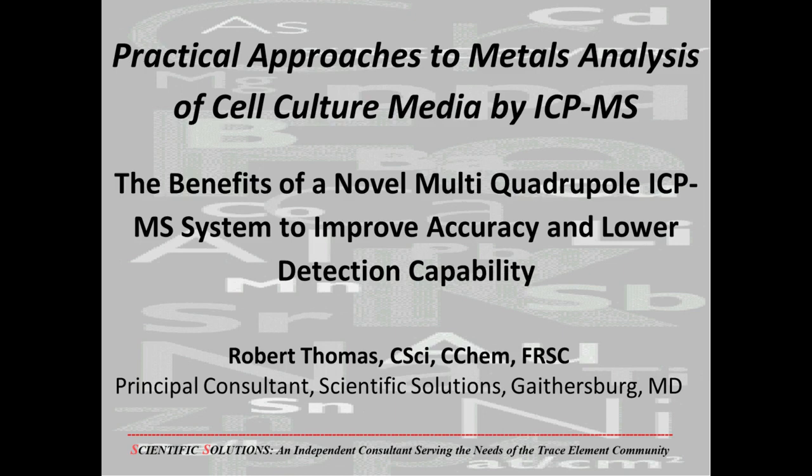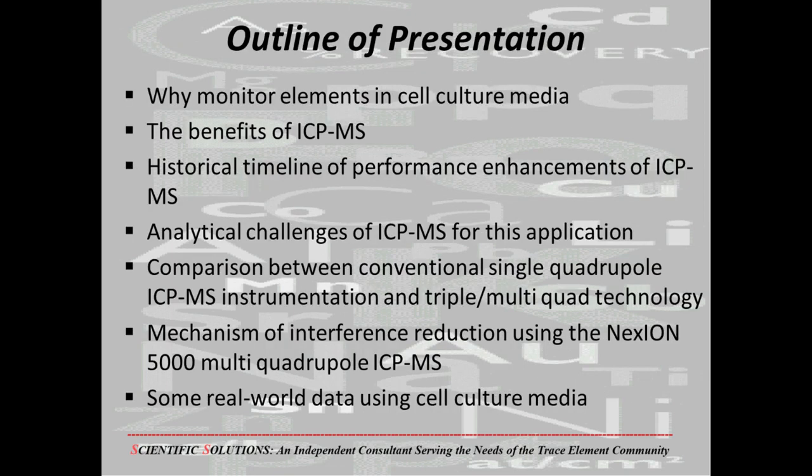My talk today will be focused on the use of ICP-MS for monitoring metals in cell culture media, and in particular, the benefits of a novel multi-quadrupole ICP-MS system for this analysis. So let me dive straight in by giving you an overview of my presentation.